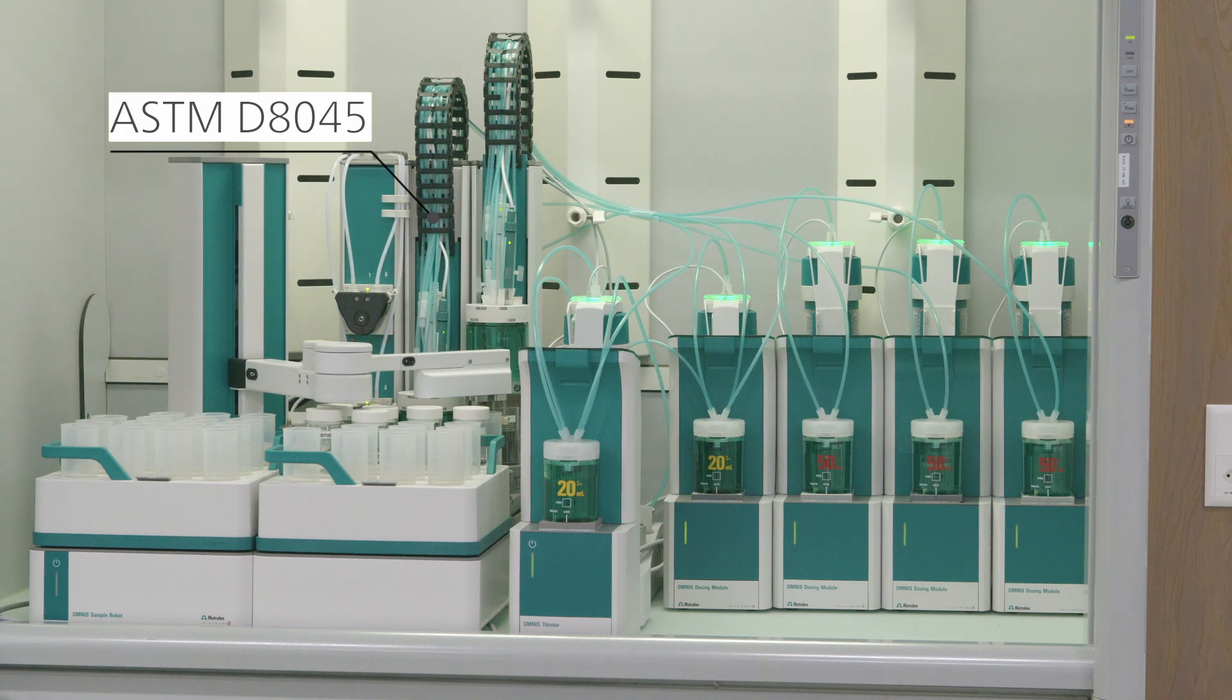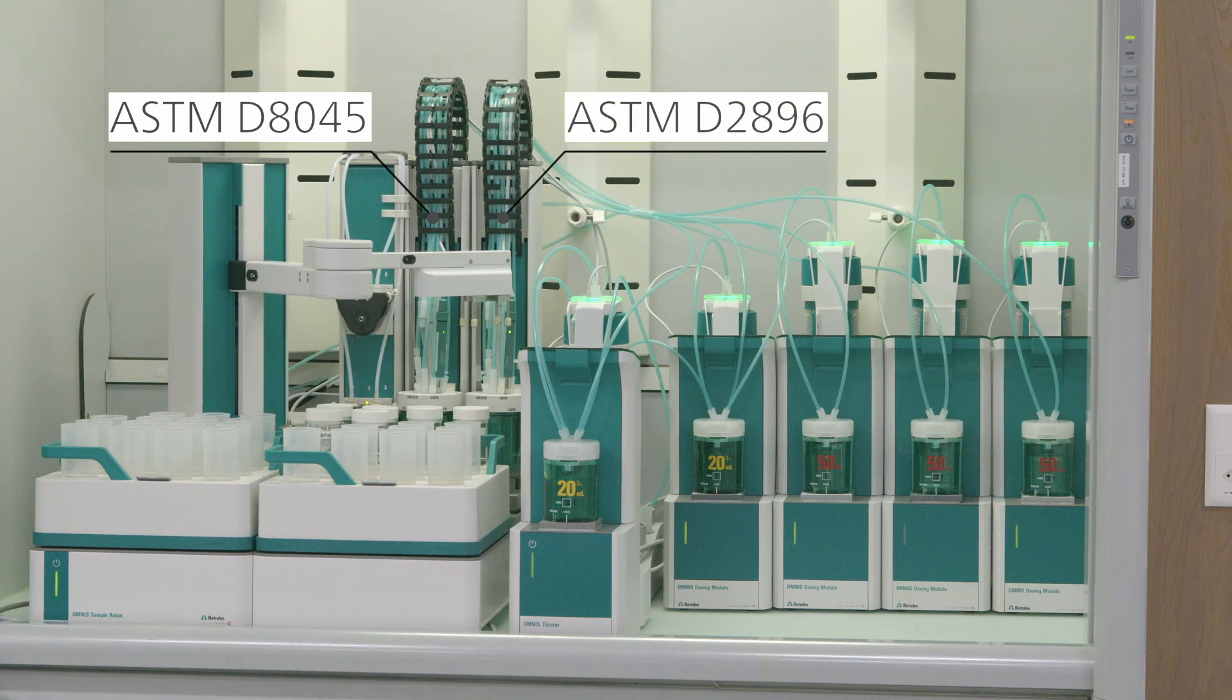And on the second workstation, the base number can be determined potentiometrically according to ASTM D-2896.